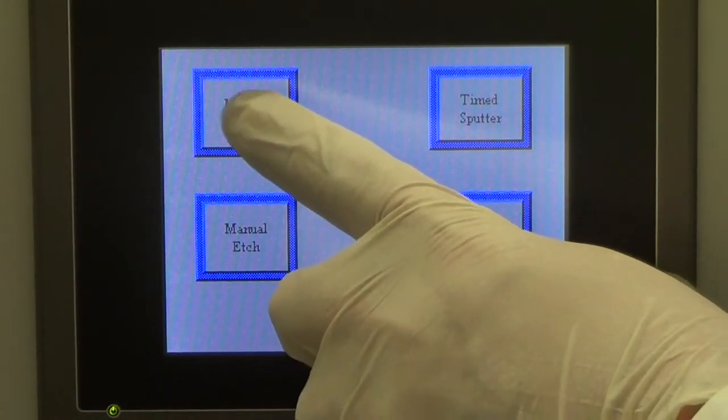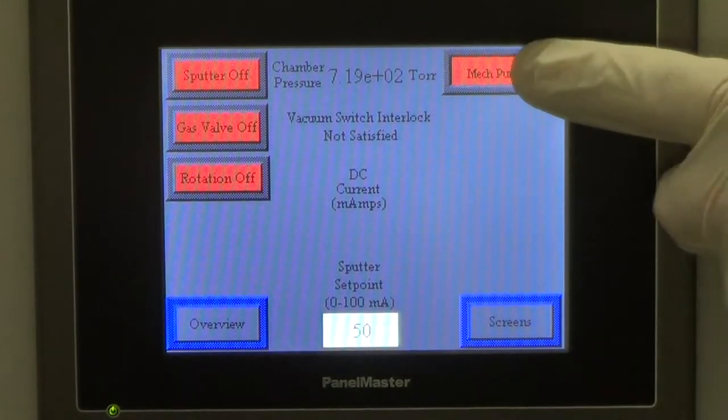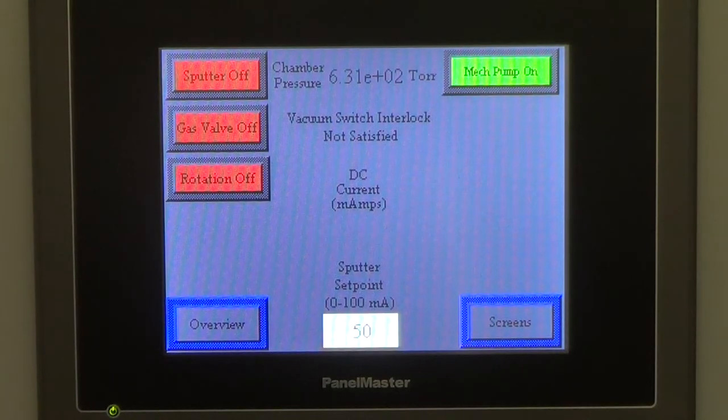Pressing screens takes you to the menu where you can press manual sputter, followed by mechanical pump, which will start the unit pumping down. Pressing mechanical pump again turns off the pump and opens the vent valve.